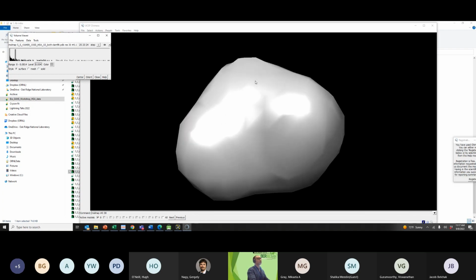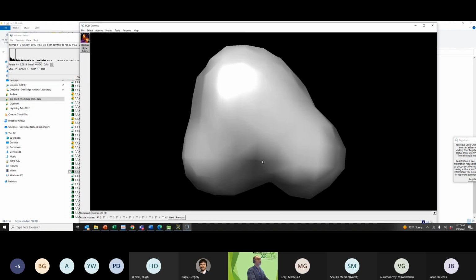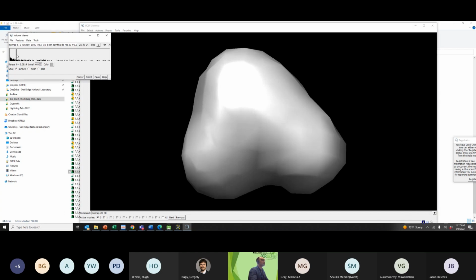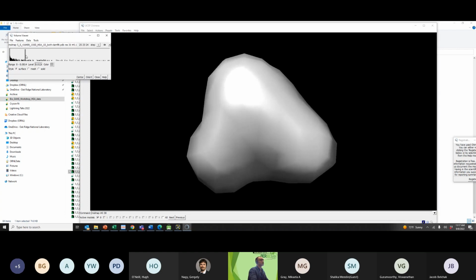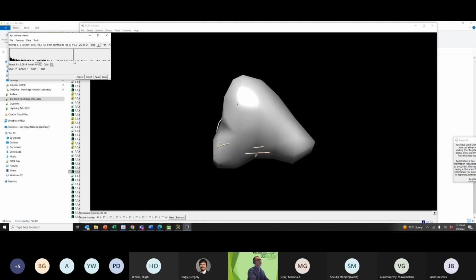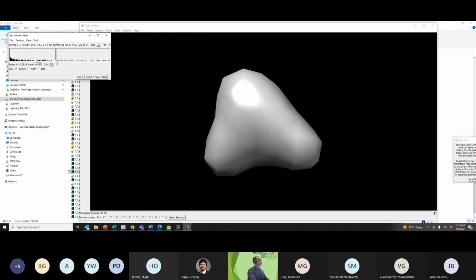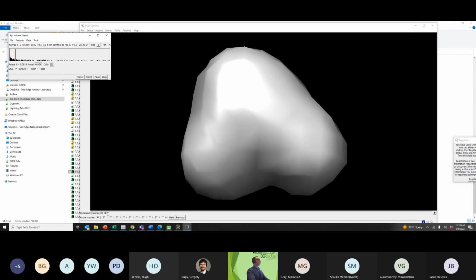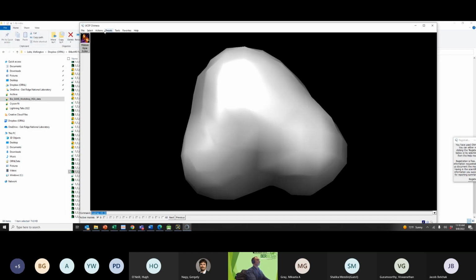And okay, so basically what I did there was to turn my reconstruction into a map. I can show how the bead structures are what we expect. I'm just expanding the reconstruction at some level of resolution, depending on how much I want to see the overall size. Let me go back to 30. Yeah, it's a good number.